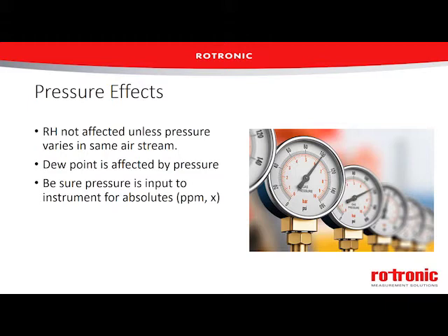Other things to know about pressure: dew point is affected by pressure, and you have to make sure when you have an instrument that has, say, a relative humidity sensor and a temperature sensor, and you're measuring at different pressures, that the conversion pressure matters with the conversion. Dew point and pressure, this is the one that's going to matter the most. If you're measuring dew point, you have to be aware that it does change quite a bit with pressure variations.